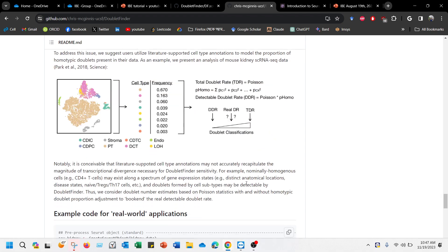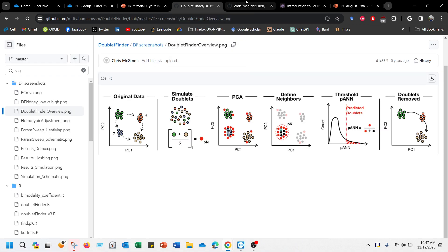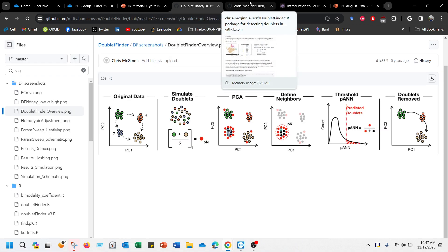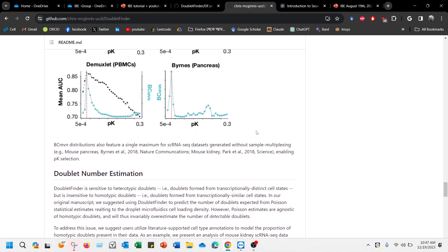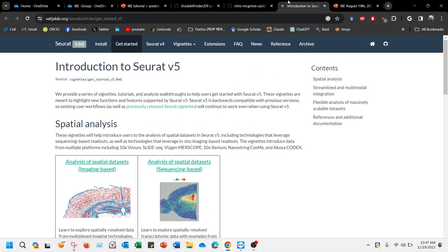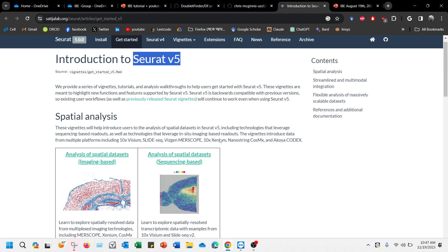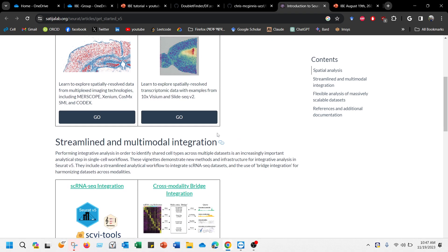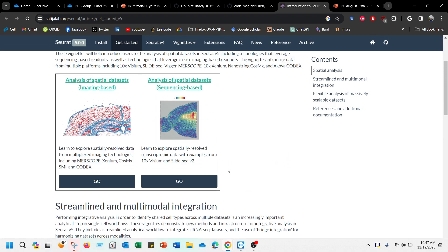So a lot of people are using it. Recently Seurat has released version 5 which came to CRAN very recently, probably the end of last month if I'm wrong, and Seurat version 5 has started updates which is kind of a good leap in terms of integrating the datasets as well as bridging multi-omics data.